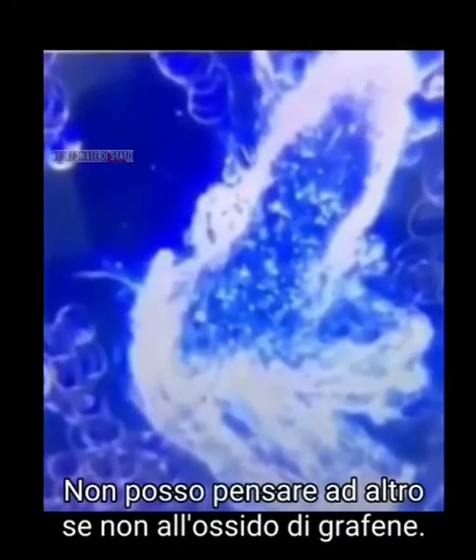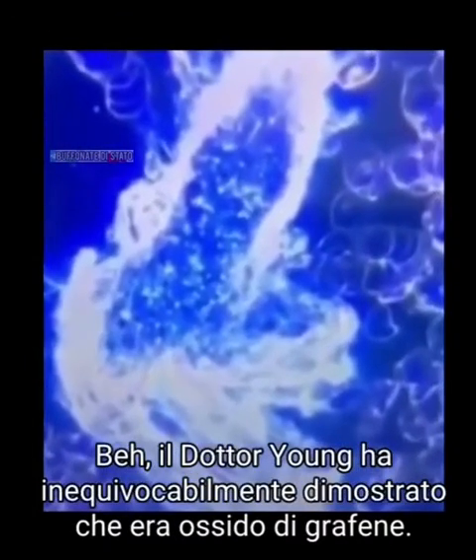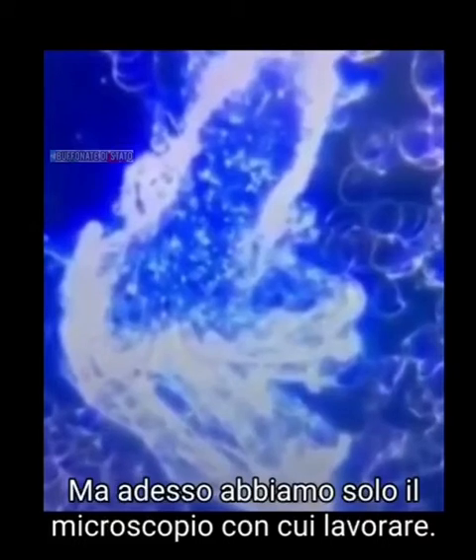So let's look at the next one and try to get through this. What are we looking at here? Here again, the blood cells are coagulated, and again there is something in the blood. It has again these things here on the side. So very similar. I can just think that must be graphene oxide. Must be graphene. Yeah. Well, Dr. Young has unequivocally proved that it was graphene. It is graphene in the blood. Yeah. But we've only got microscopy to work with right now.